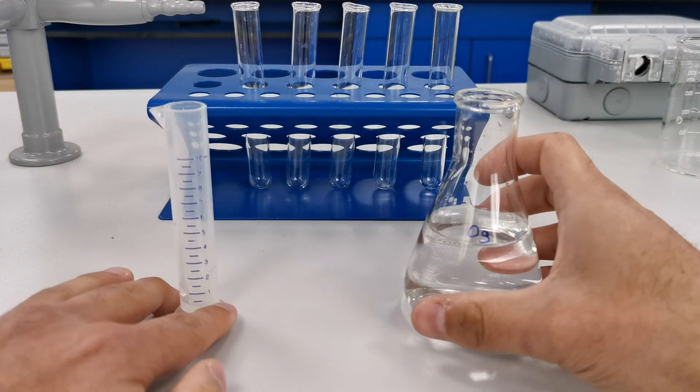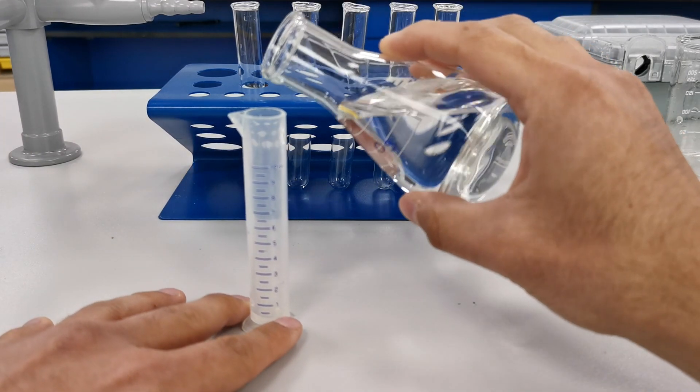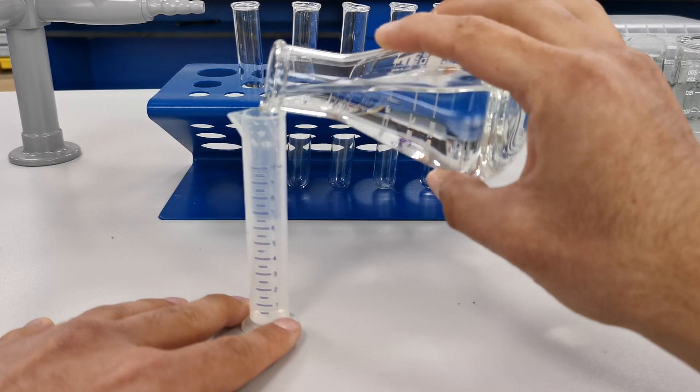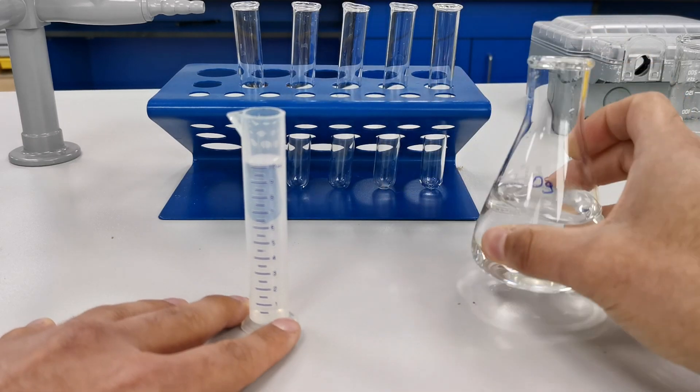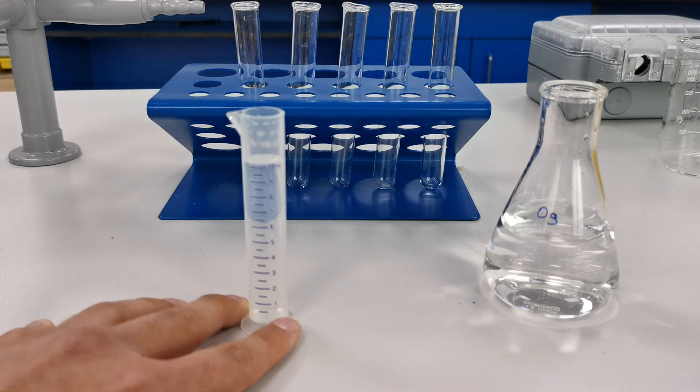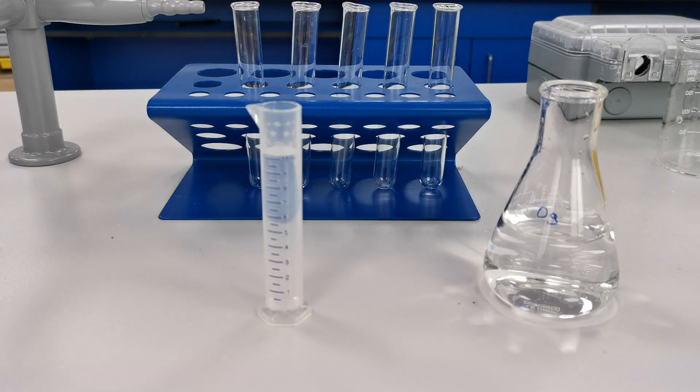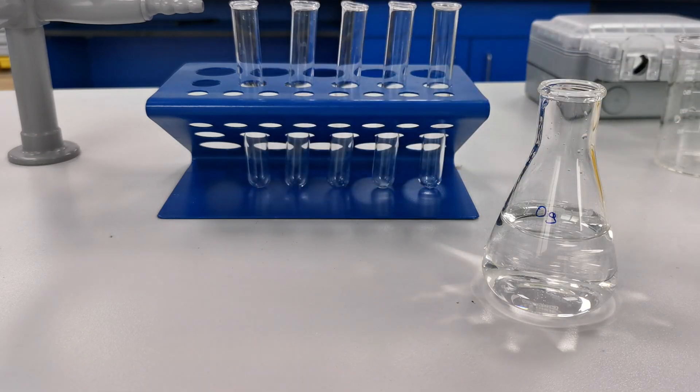I'm going to start by measuring ten centimeters cubed of the lowest concentration of sugar solution, which is zero molar. So this is just distilled water. And remember to measure these at eye level to avoid parallax errors. I'm then going to pour this into the test tube.